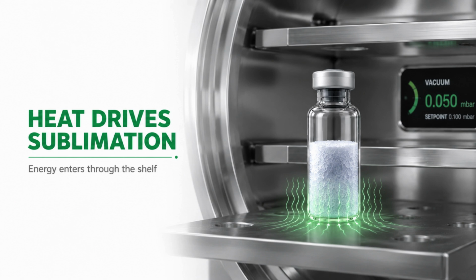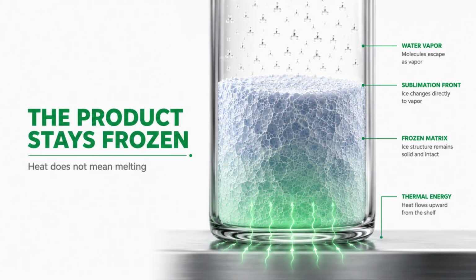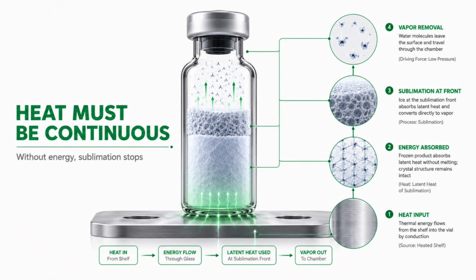Vacuum alone cannot drive sublimation. The product also needs energy. Heat is supplied gently through the freeze dryer shelves, conducted through the vial, and transferred into the frozen product. This energy allows water molecules at the ice surface to escape as vapor. Even though heat is continuously supplied, the product remains frozen because the temperature is carefully controlled throughout primary drying.